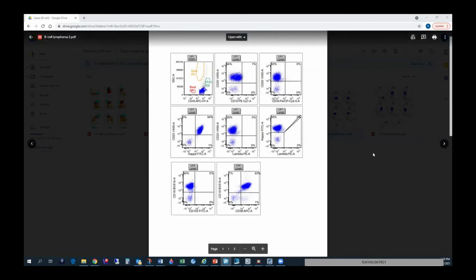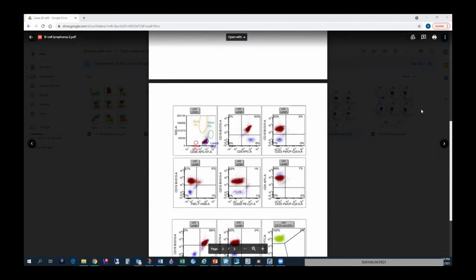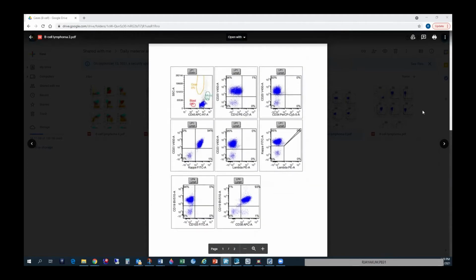Right. Okay, so this is case 2. Any volunteers for case 2? I can't see. Okay. Can you see or no? Have you opened it? Is this case 2? Yeah. Okay. Isn't that the one that we were already doing? Yeah, I think it looks like that. That's the one that we were already discussing. Is it? No, it's not. Yeah, okay, it's closely related. Yeah, who's going to? Yeah, I can.